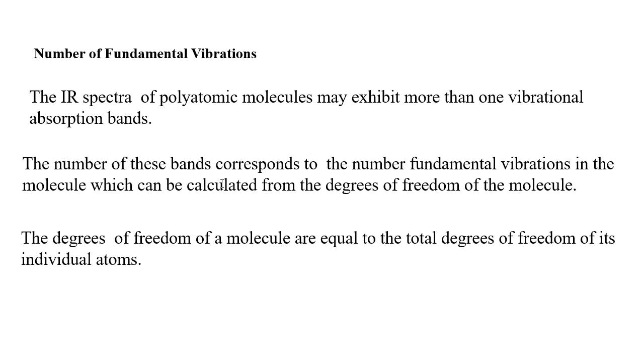The number of these bands corresponds to the number of fundamental vibrations in the molecule, which can be calculated from the degrees of freedom of the molecule.